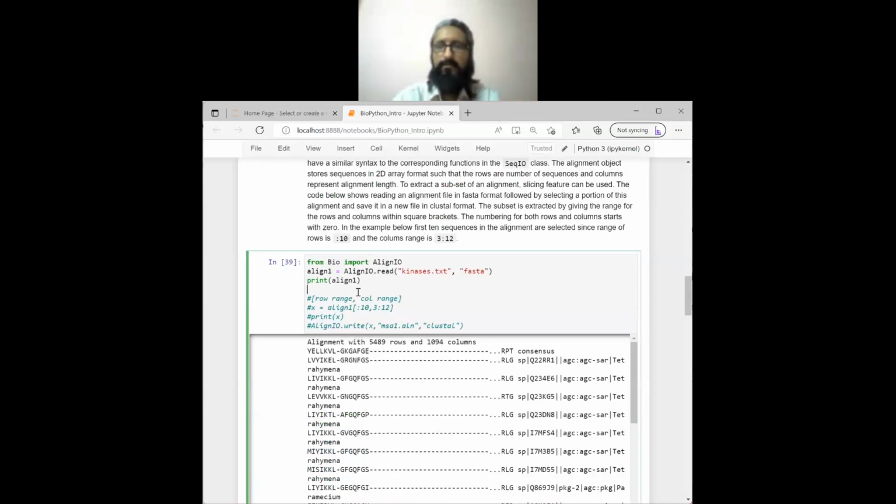So, sir, what is the output coming from AlignIO? No, this output that has come. Yeah, I'll explain this output. Sir, which algorithm is AlignIO using? See, I just answered that question. AlignIO is not for doing alignment.